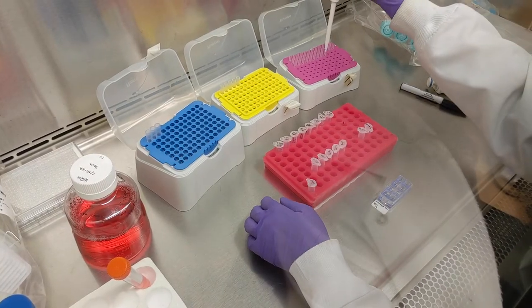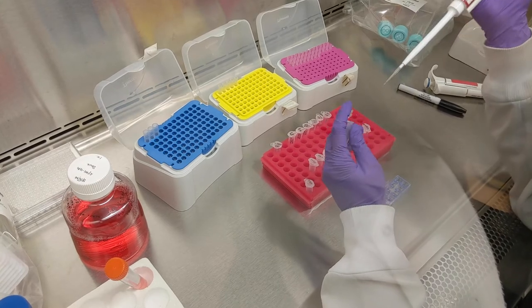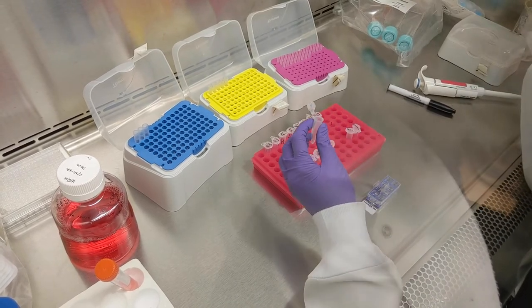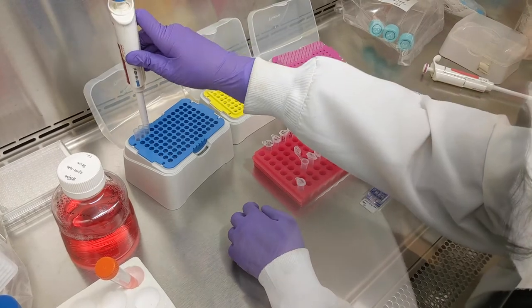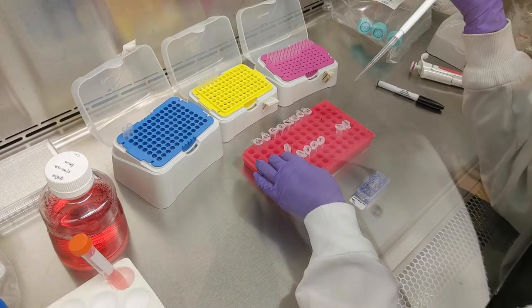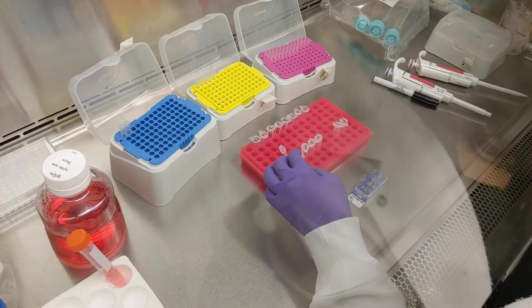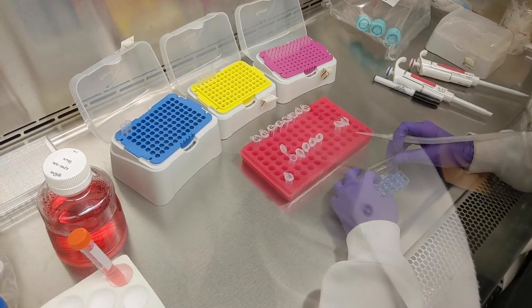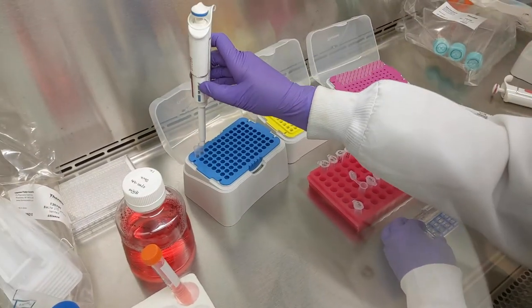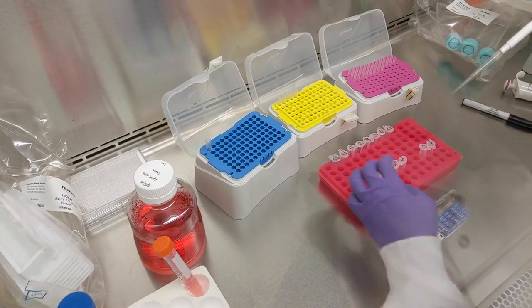Okay, so here we're doing some cell culture work with antibody drug conjugates, or ADCs. So we'll be incubating the cells with the antibody drug conjugates at various time points to see how the cells traffic and process the ADC over that time course. One of the ways that we'll be processing these samples is using pharmacodynamic staining, or PD staining. This helps us track the response of cells to the cytotoxic payload that they're being treated with. How we're able to do this is we have a fluorescent marker that is able to mark the DNA damage. And as cells experience this DNA damage after treatment with the ADC, we're able to see how that shows up over the time course, which gives us information about how the ADC is trafficked into cells, how quickly it's internalized, and other things of that nature.